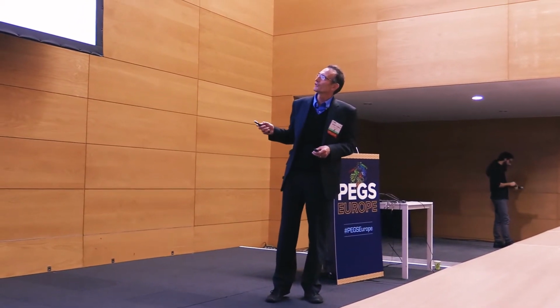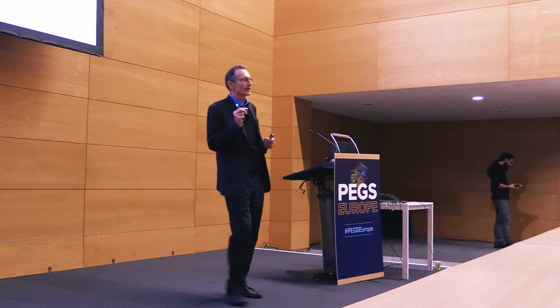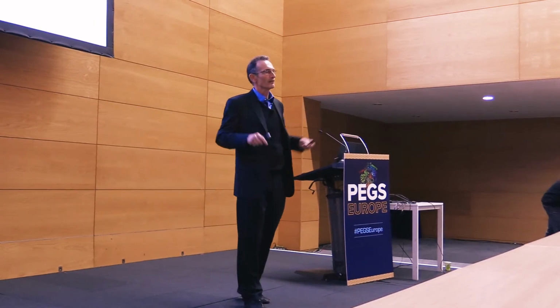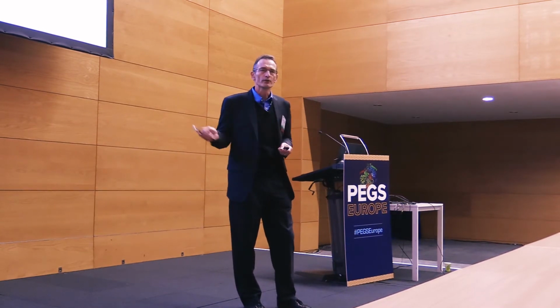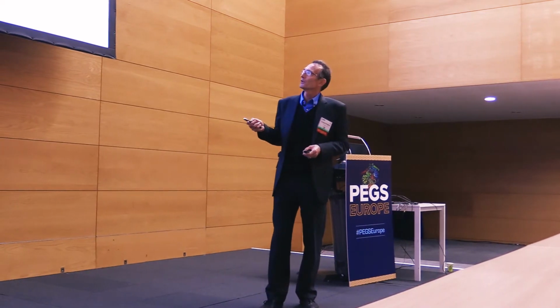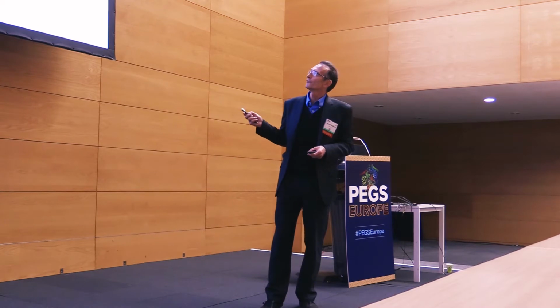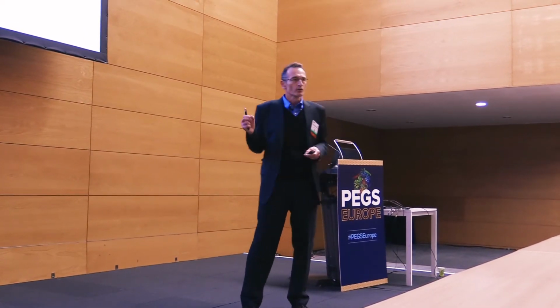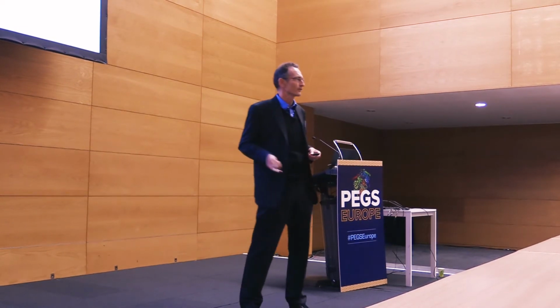Generation 2 was essentially conceptually identical, except that rather than using pooled primers, we separated primers, and we did over 500 PCRs, assembled them together, and there was quality control using next-gen sequencing all the way through the process. And we found that by doing this, the affinities of the antibodies that came out were better than the affinities of the antibodies that came out here. One of the surprises here, as I'll show later, was that the diversity of the antibody library was far less than we thought it was when you actually measure it.